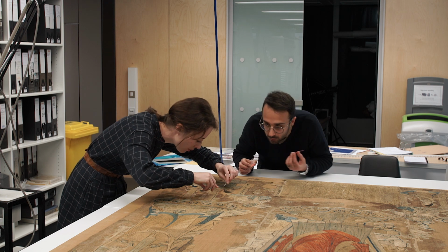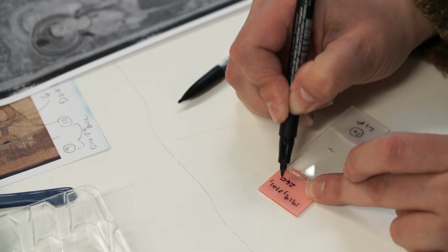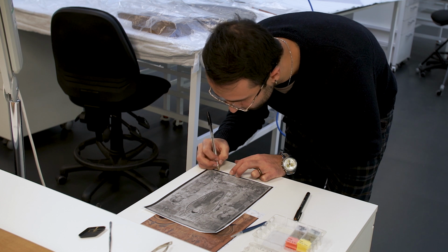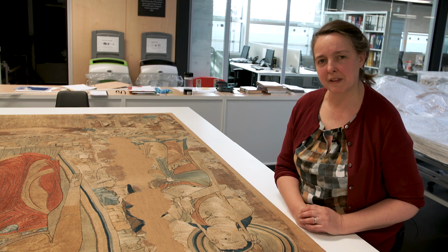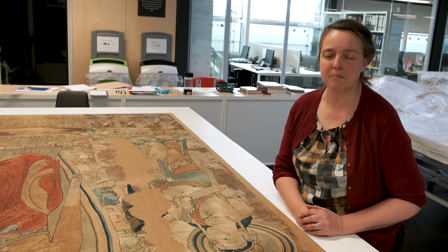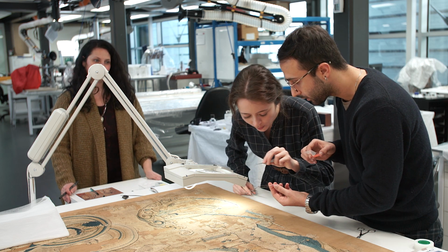The method which they're going to use to identify the dyes is a destructive technique and does involve taking small samples. It needs about 1/2 centimetre length of each fibre. And so because it is destructive, we have thought very carefully about whether this is appropriate and have discussed it with the curator. But on balance, I think that what we will learn about the embroidery outweighs the sacrifice of a small sample.